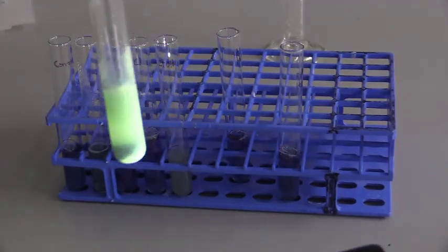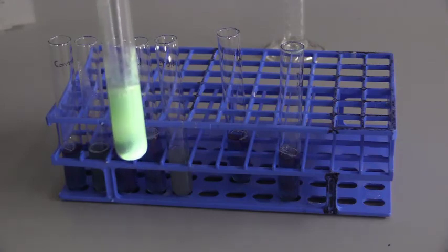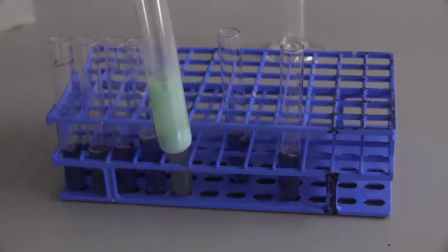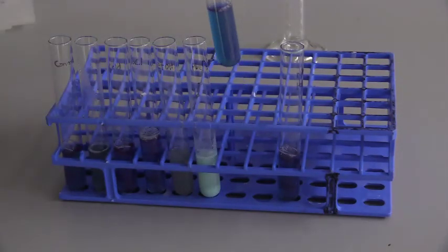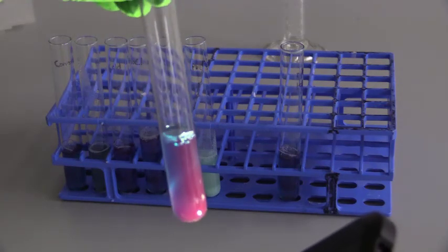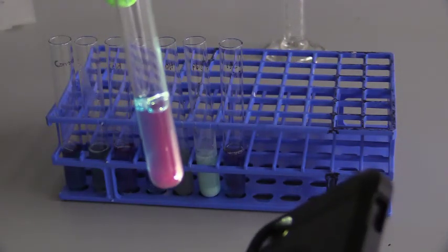This was the lead nitrate, and you can kind of see some chunks down in there. This was the acid followed by base. And this was the base followed by acid.